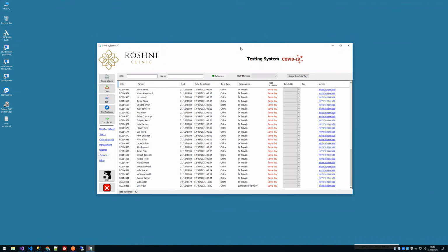The key thing for me is to get clinics up and running, so they can actually do their day-to-day tasks. Like Bilal was doing 20 tests a day at one stage, and now he's doing at least 200 plus. Because he's not manually writing certificates or sending out emails and so on, because this is all seamless through the application. The patient already gets an email to say their details have been received into the system. So it's happening seamlessly in the background.